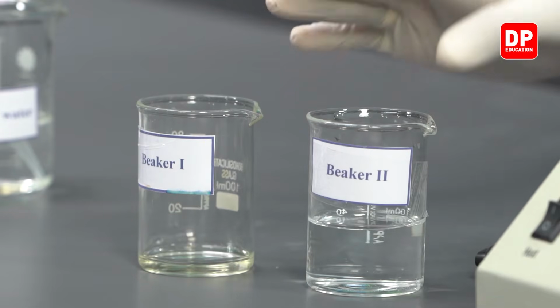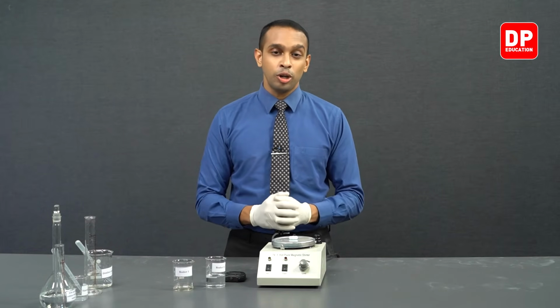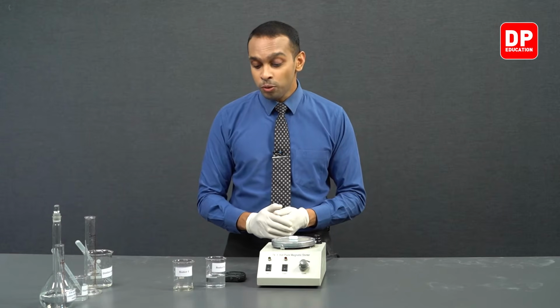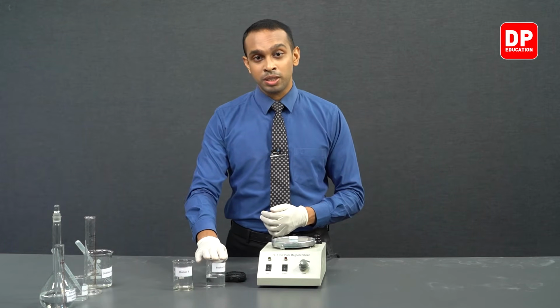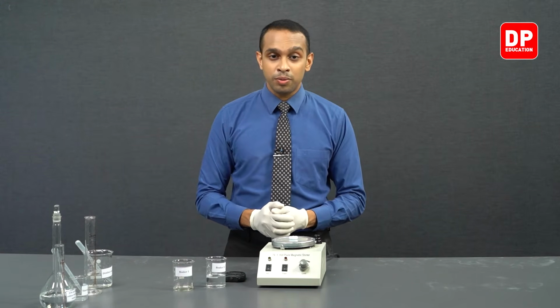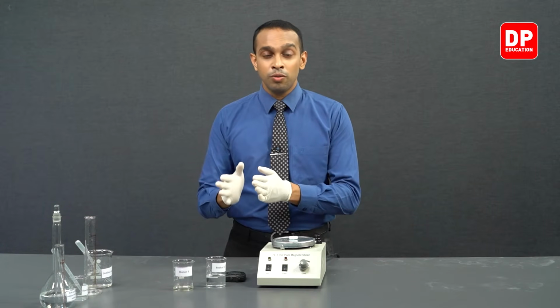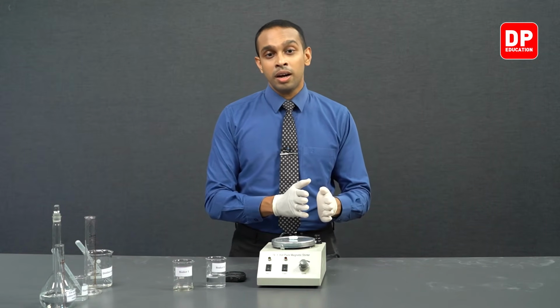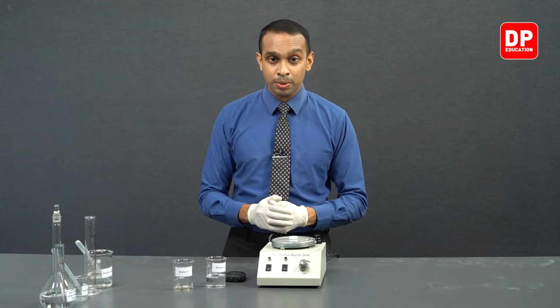So the total amount of I2 produced is not going to be sufficient to produce a color change in this reaction mixture, because all of the I2 produced gets reacted with the thiosulfate ions in the medium, because the amount of I2 produced will be lower than the amount of thiosulfate ions present in the medium.